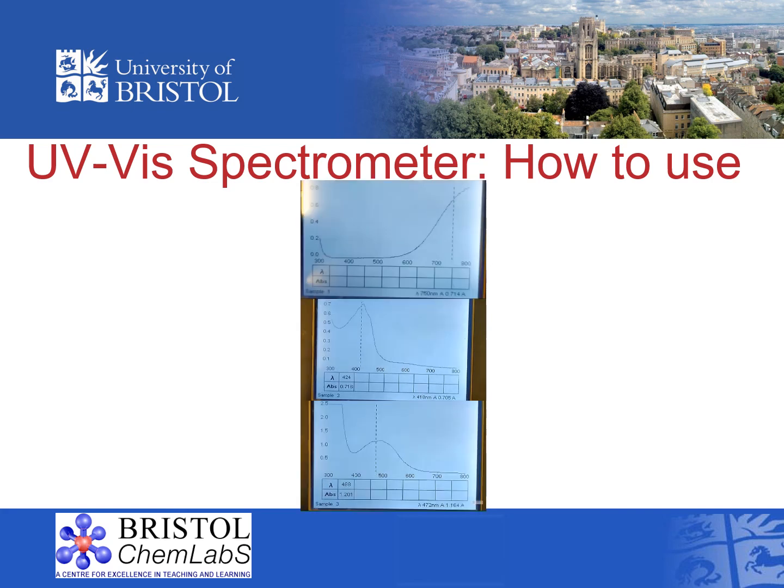We ran 2 other food dyes. Each food dye is a differently conjugated molecule that absorbs strongly in certain areas of the UV-Vis spectrum, and transmits the other wavelengths, giving the molecule their color.